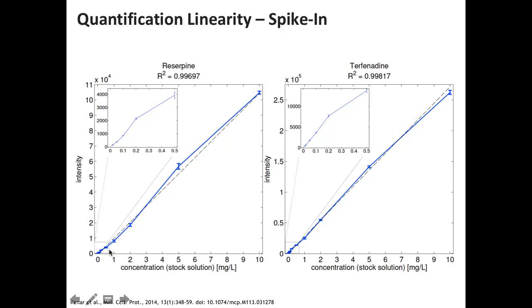You see it covers quite a range. And as you can see, the linearity of that is the feature intensity that was extracted from this feature finding algorithm as a function of the stock concentration that was put in. And we got R squared of 0.997, 0.998, so that looks quite decent over about 3 orders of magnitude, 3.5 orders of magnitude.